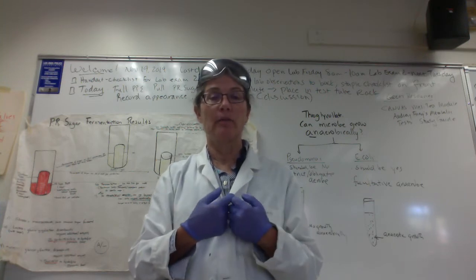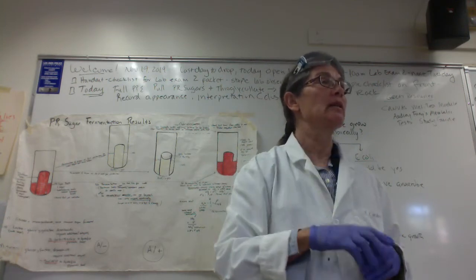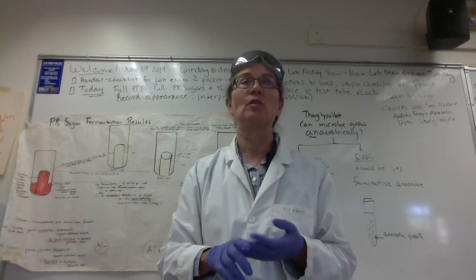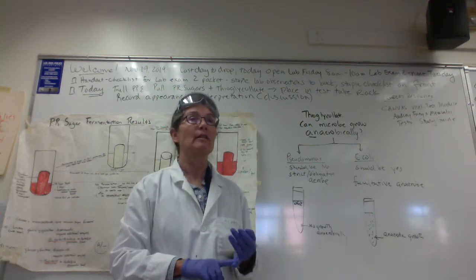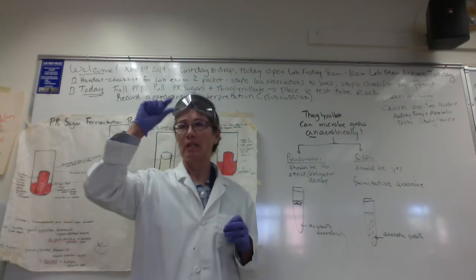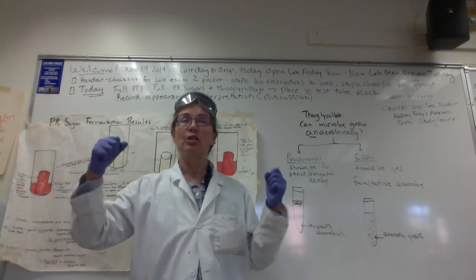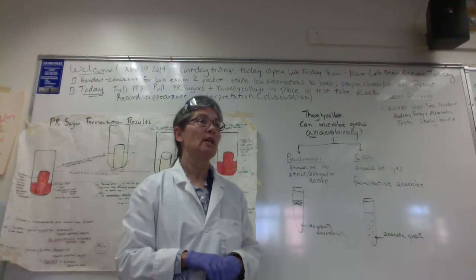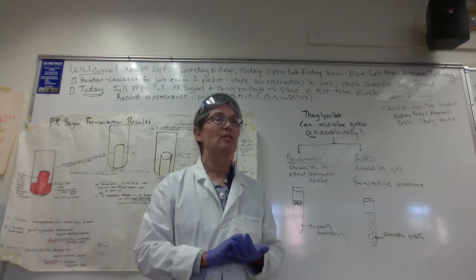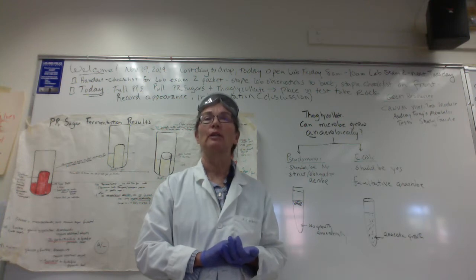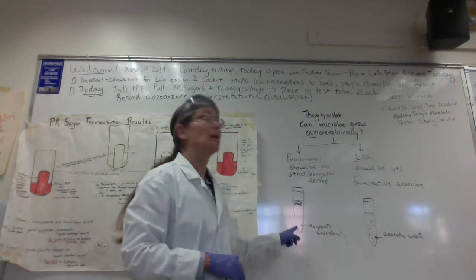Now let's talk about the thioglycolate media. We're really careful not to mix or shake it. The thioglycolate reduces molecular oxygen and creates an anaerobic environment in the bottom of the tube. At the top is a redox indicator — we're using methylene blue — which should be green if oxygen is present. We very carefully inoculated our thioglycolates straight down and straight back up, didn't shake them, and put them in the incubator. What we're looking for today is the pattern of growth — where are the cells growing? We use thioglycolates to answer the question: can my microbe grow anaerobically?